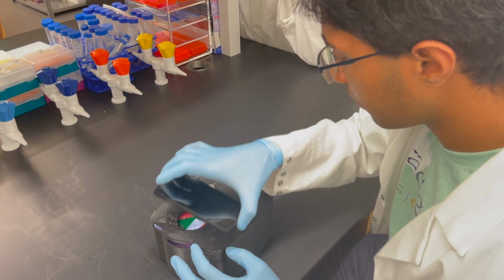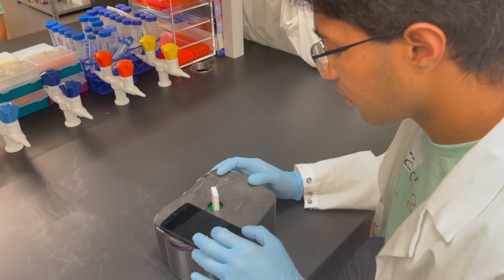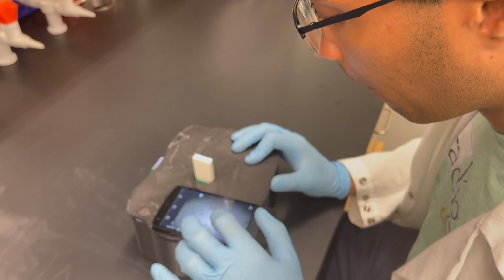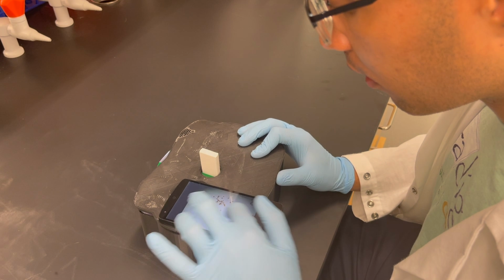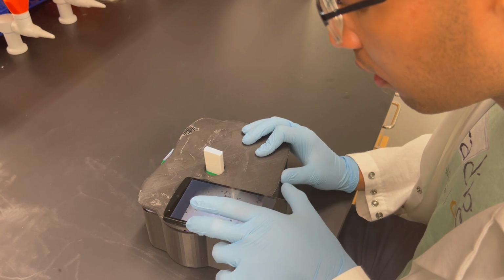Next, an image will be taken of each well on the slide using the phone, with any adjustment of the image being done as necessary. Finally, the imaged stool samples will be analyzed using an automated egg counting algorithm to determine disease intensity and prevalence.